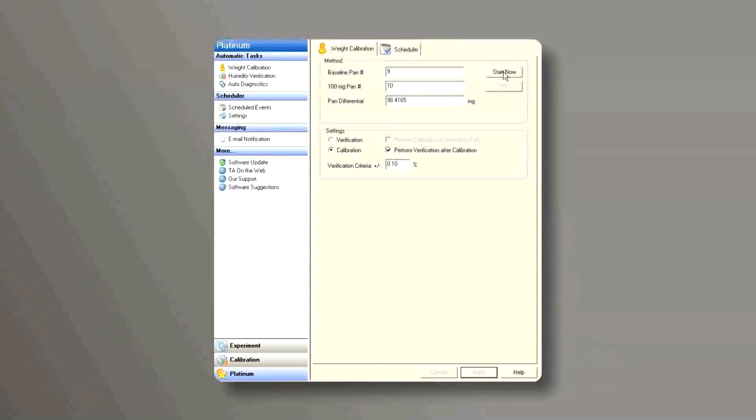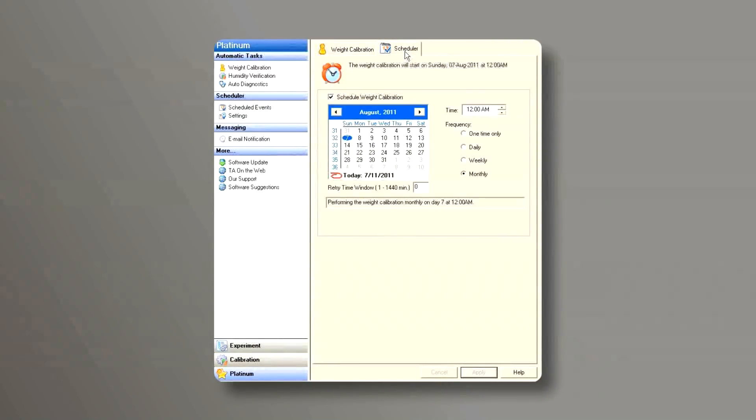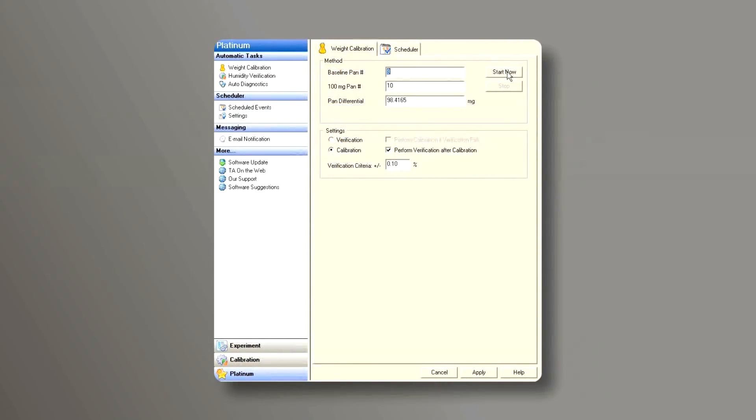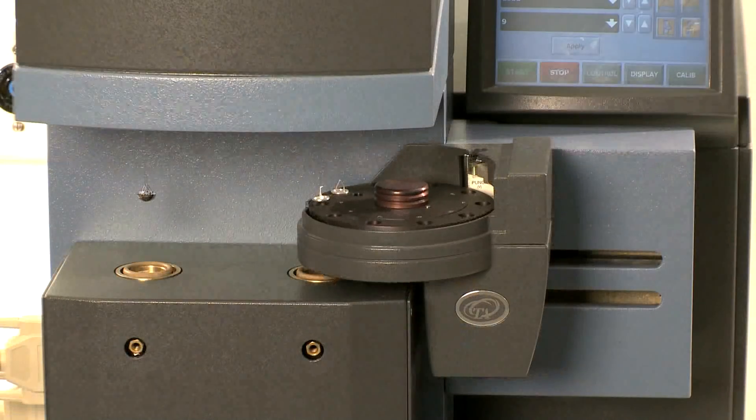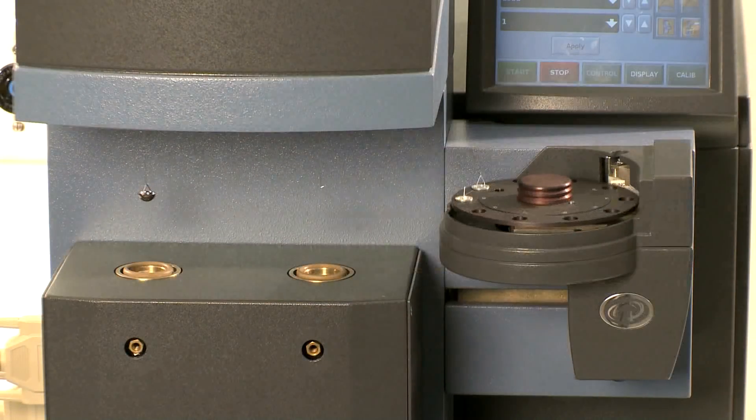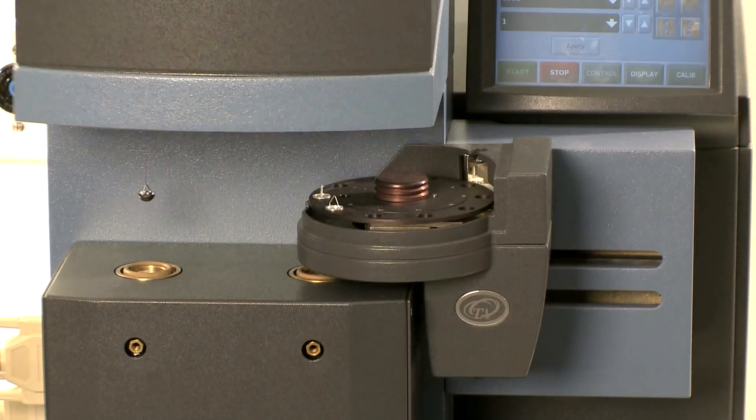You can either start now or schedule it later from the scheduler. Now we're just going to click start now to start the calibration. The whole process will take less than three minutes.